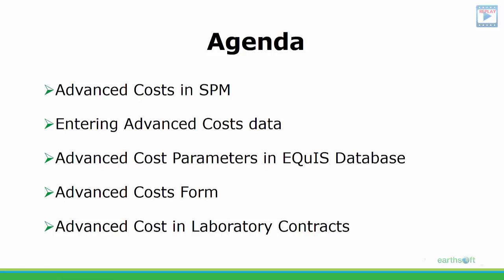Today we'll be presenting a very powerful feature in SPM, which is advanced costs. This feature is intended to be used with SPM to offer a straightforward calculation of costs associated with samples submitted to the laboratory for analysis.